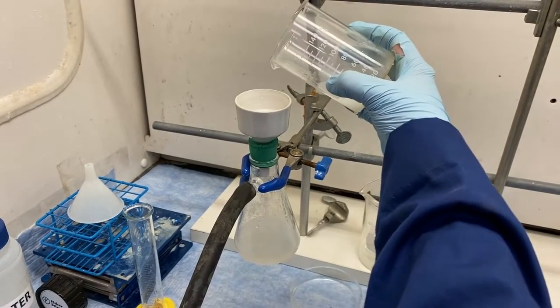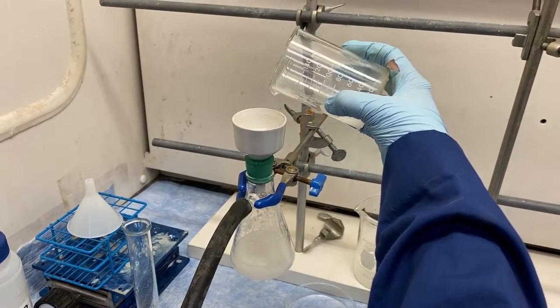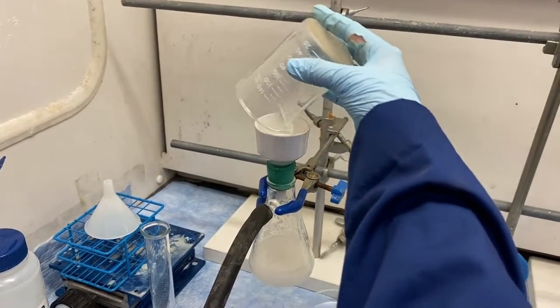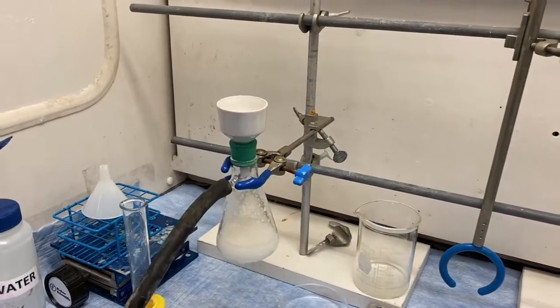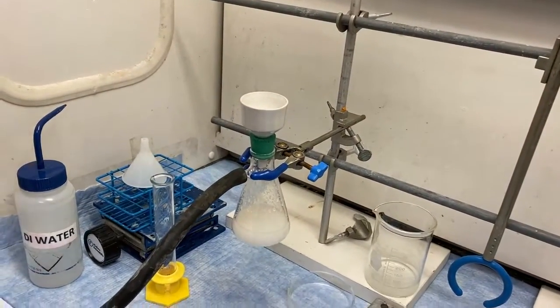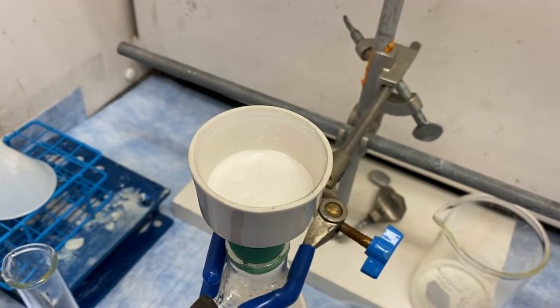The crystals that we form here are relatively fine, so if Karen dumps it in too quickly, we'll see the filter paper get clogged, and then it just becomes a nightmare to get it off. Okay, and so again, it looks like some of it went through the filter paper, which is not unusual, but if you look over, you can see that there actually are some crystals on the filter.